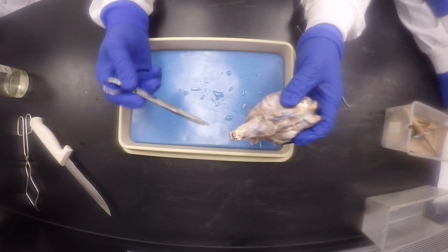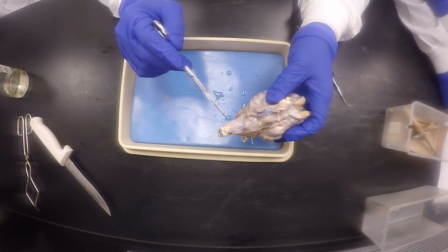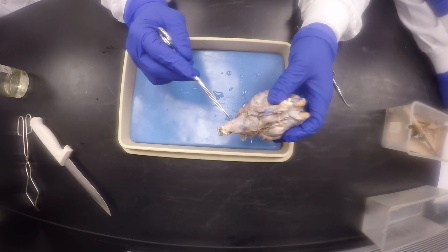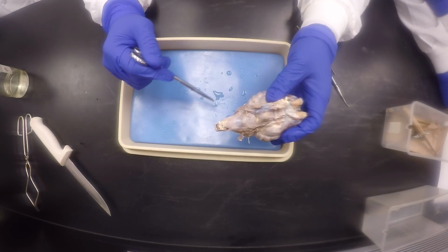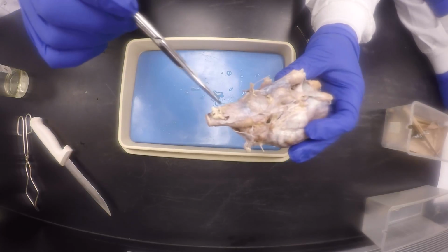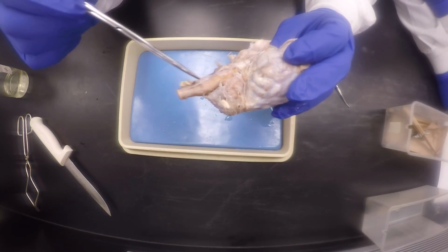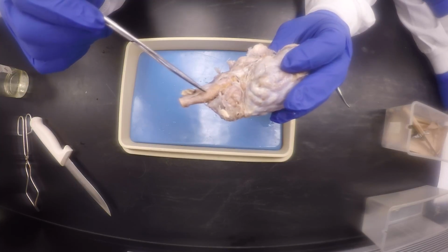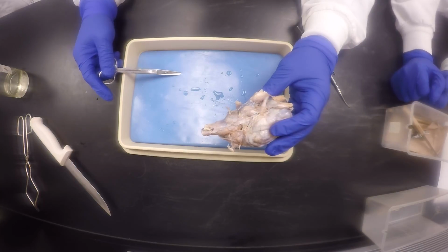So usually if I stick a pin over there, even though you don't really see anything, because like I said, these cranial nerves get cut off, this will be cranial nerve number 12, the very last one on the medulla oblongata before we get to the spinal cord. So I usually put a pin here, even though you can't really see anything. Maybe you can see some remnants here, but you may have a better one on your brain. Know that this very last one right on the medulla oblongata is the hypoglossal, number 12.